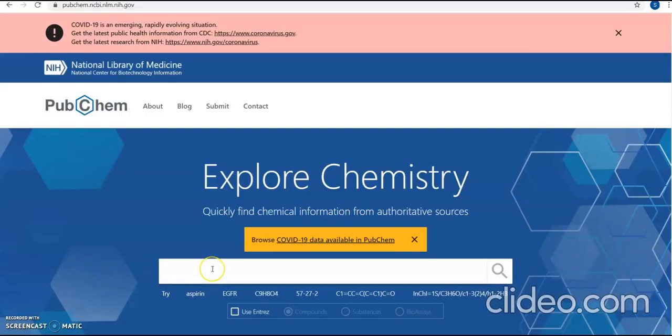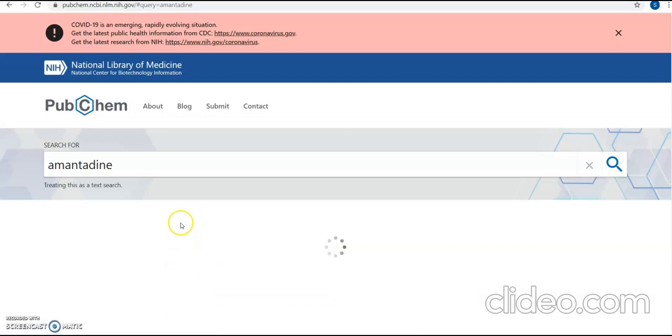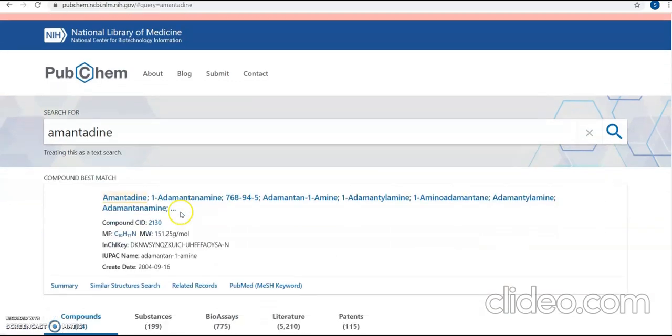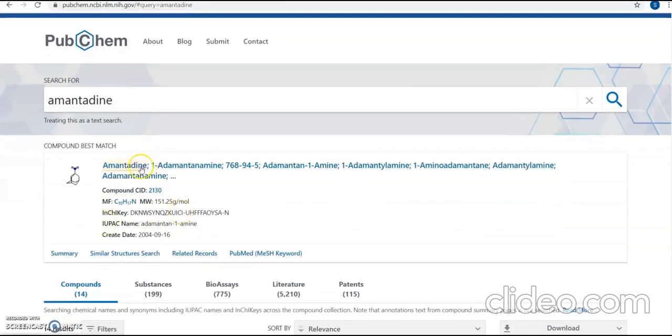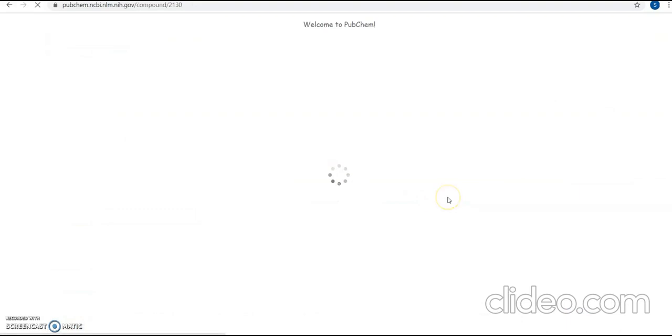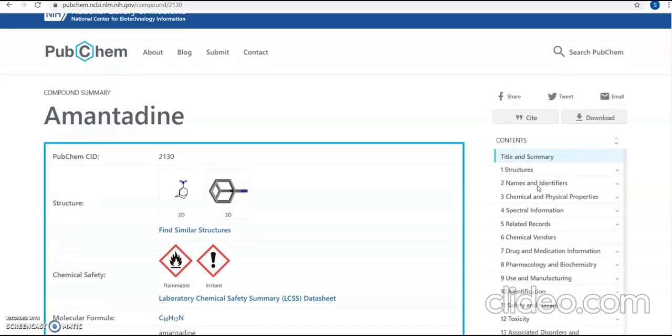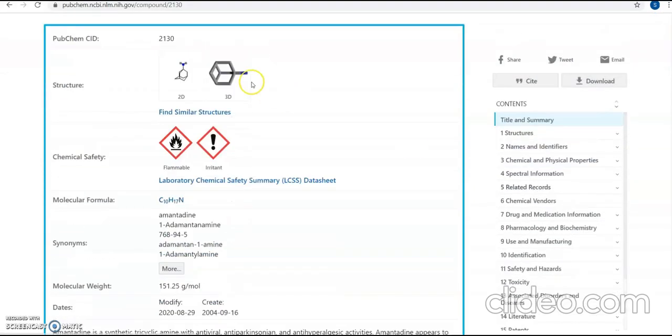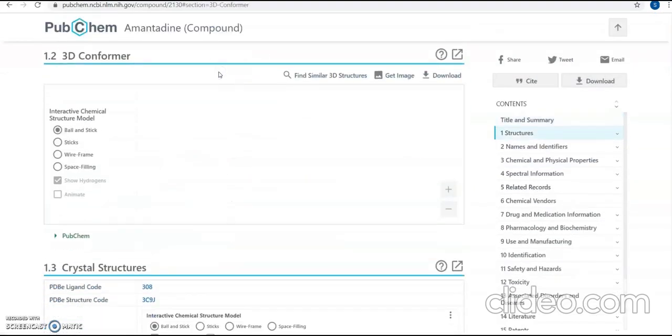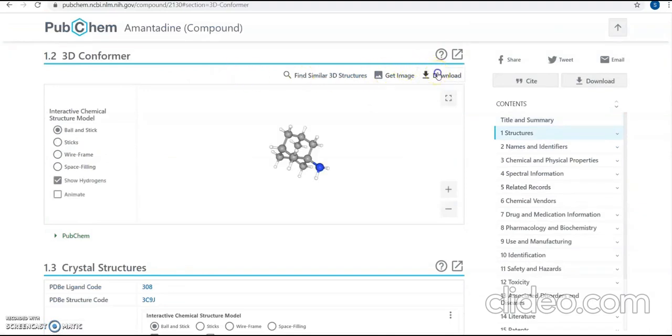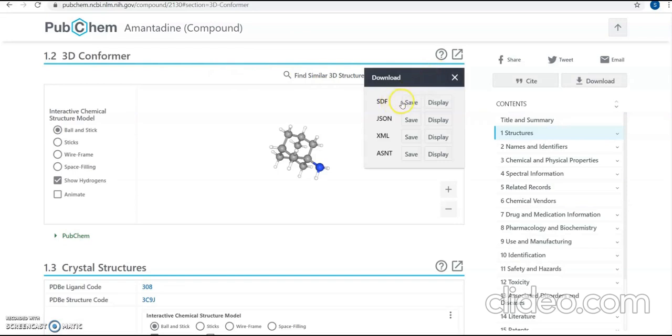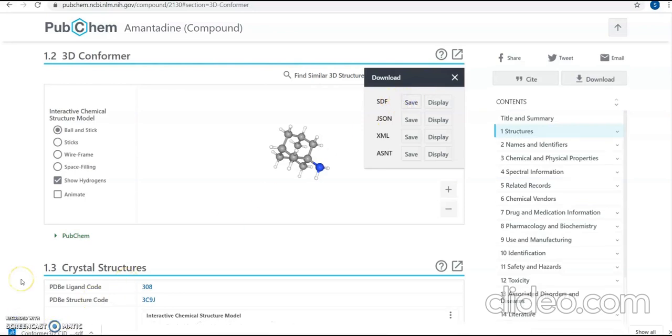So for example, where we can use Open Babel, let's say that we need a ligand, say amantadine. Now you can download this again from PubChem. You need a 3D structure. So click on 3D structure. Wait till it appears. Download. We'll be downloading the SDF file.